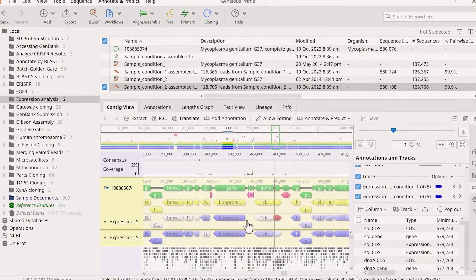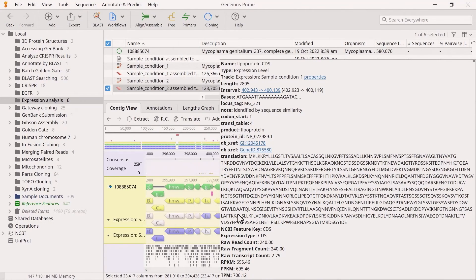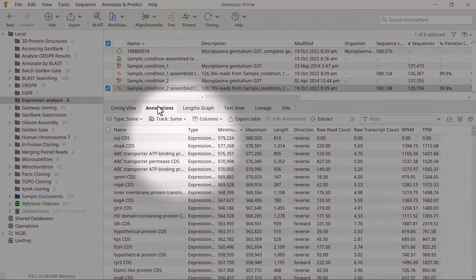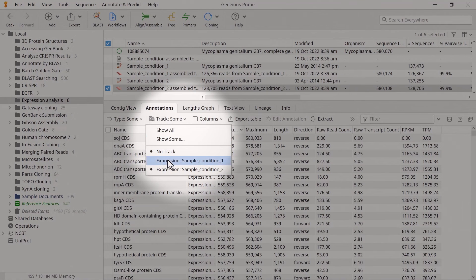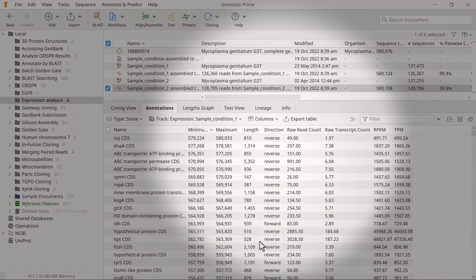If you scroll over an individual expression annotation, you'll see a pop-up window containing the values for RPKM, FPKM, and TPM, and the raw read counts for that coding sequence. You can view these data in tabular format by switching to the Annotations tab, then specify the track and adjust the data shown using the column's drop-down menu.